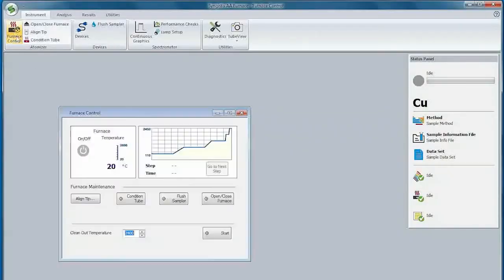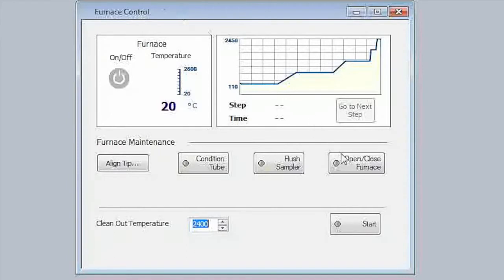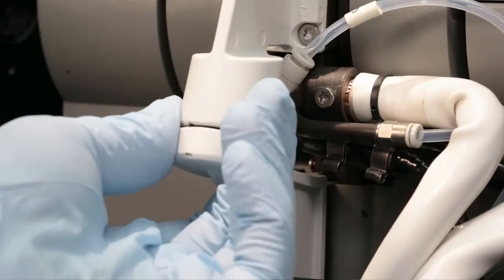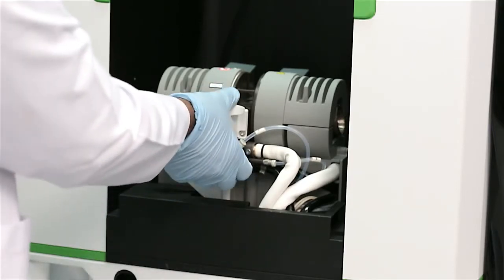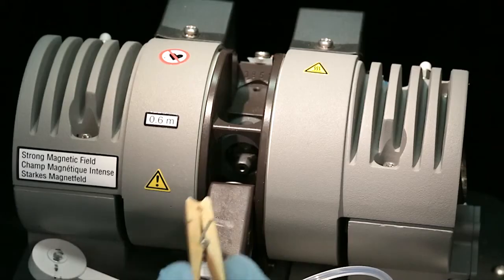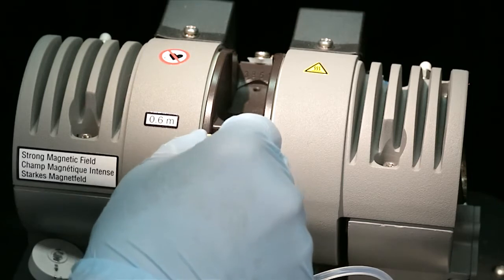Click the open/close furnace button in the furnace control window of the software, then swing the support lever to the side and tilt the front contact housing downwards. Use the insertion removal tool to remove the graphite tube.